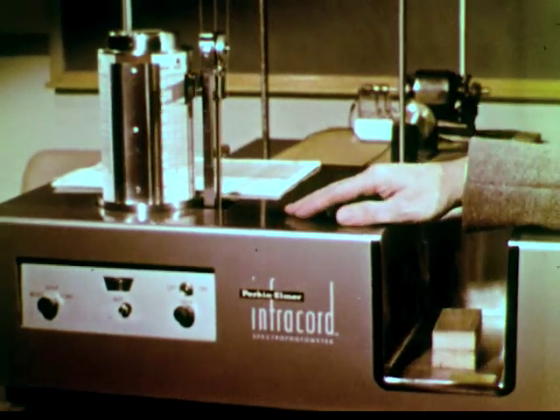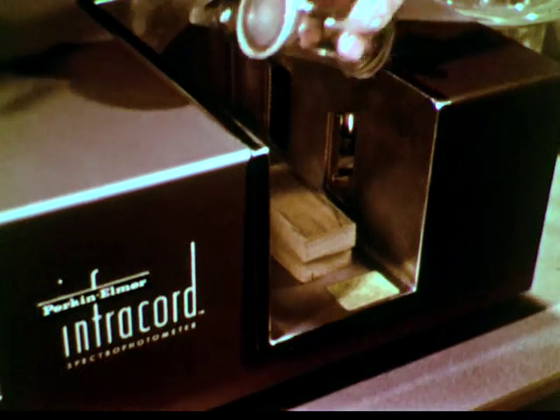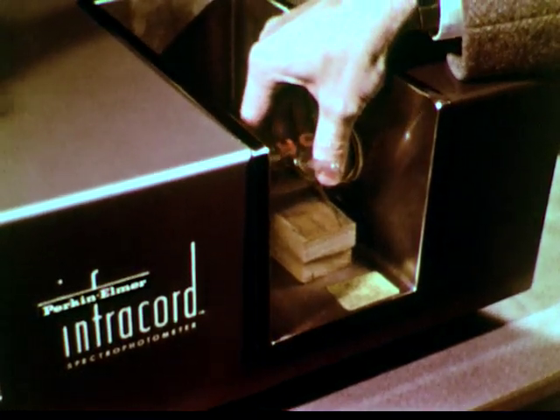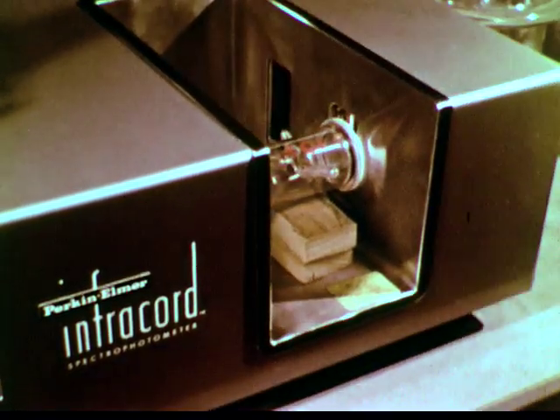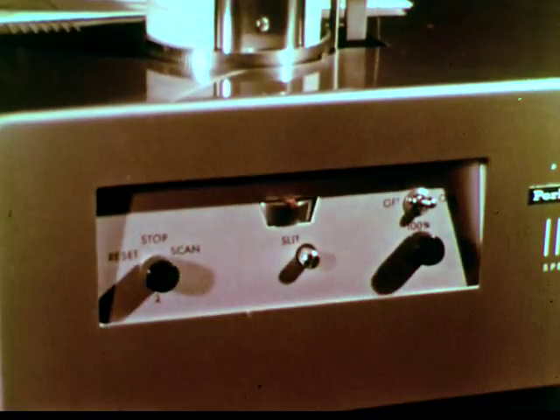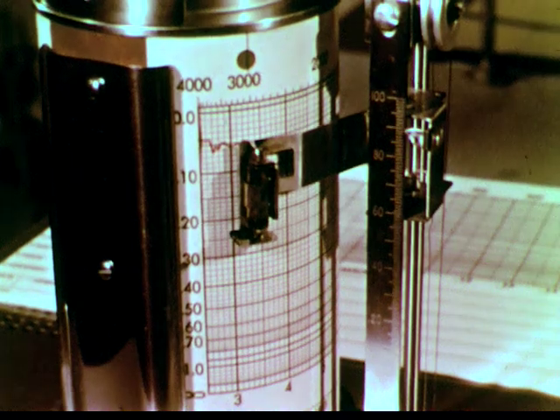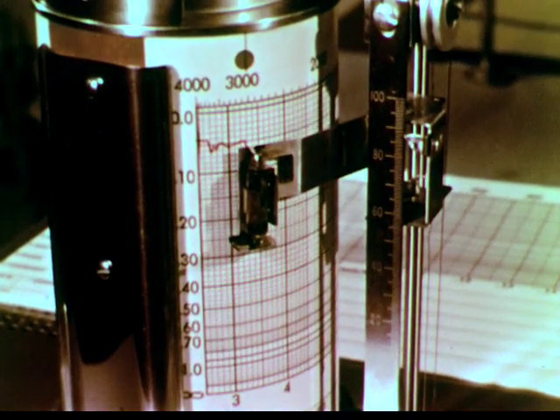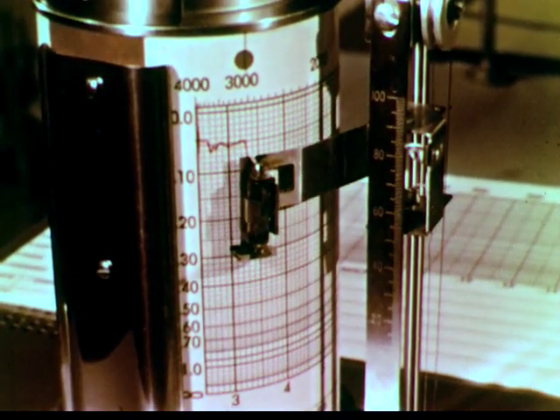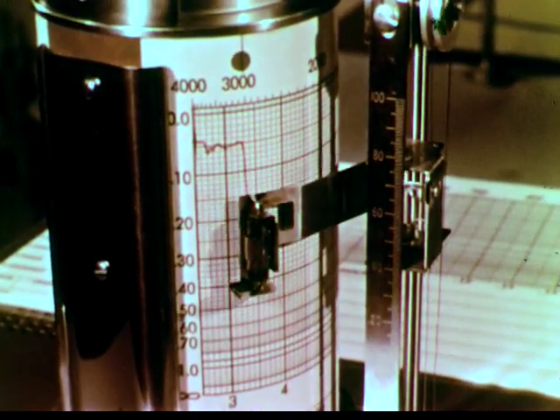For our first infrared sample, let's try a simple molecule, HCl in the gas phase. We start recording and scan to lower frequencies. The HCl sample is transparent at all frequencies until we get to 8.67 times 10 to the 13th cycles per second, where the sample absorbs quite strongly.